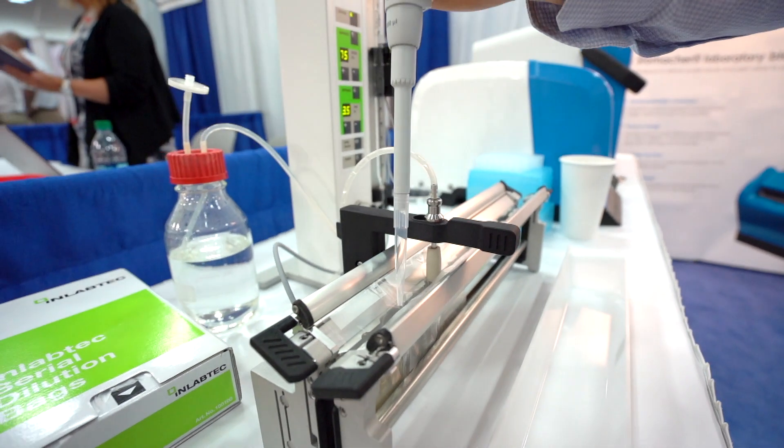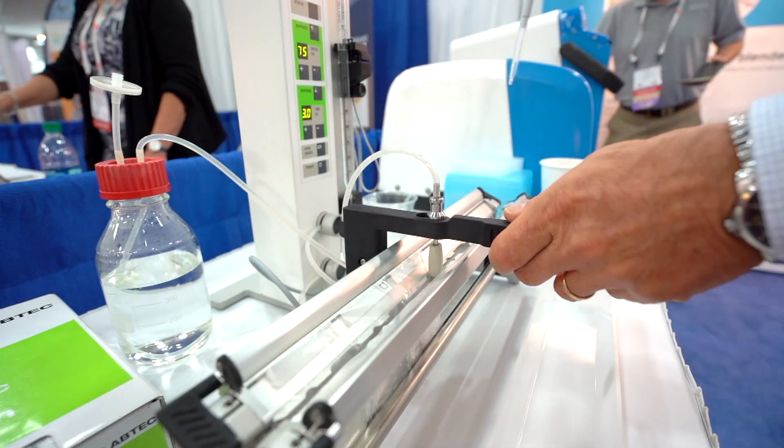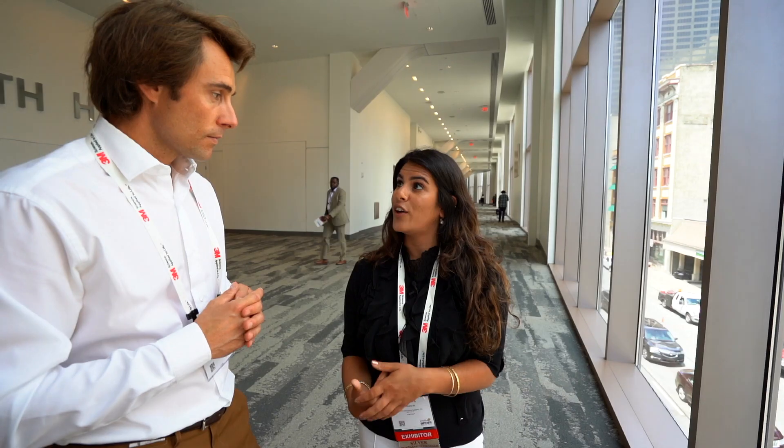We can ensure the sterility because certain aspects like the tubes and glassware are autoclavable, and because you're changing pipettes with each Serial Dilution, that ensures the sterility as well.